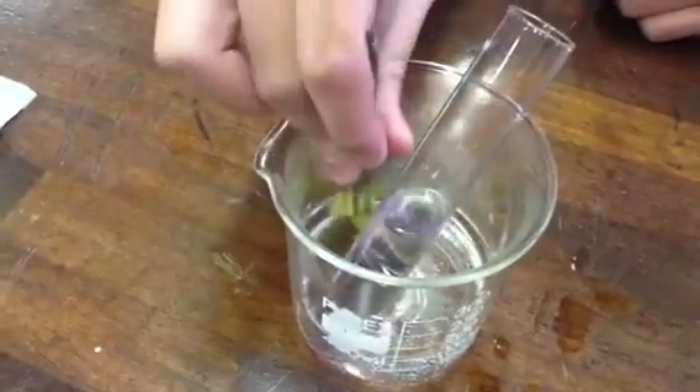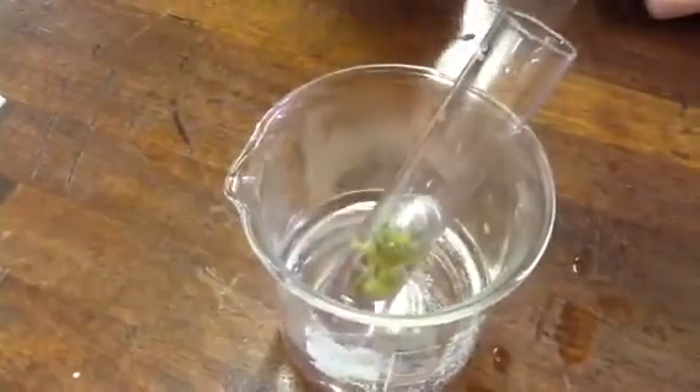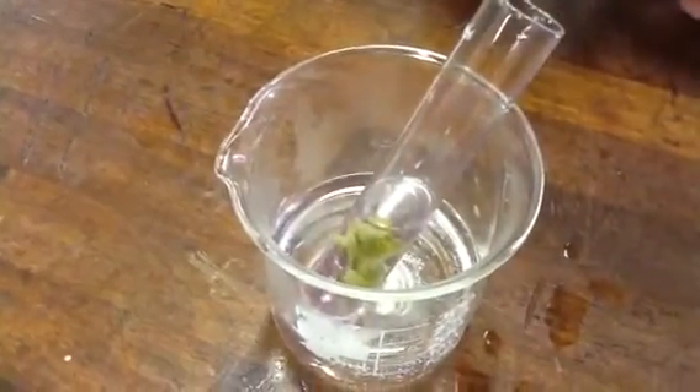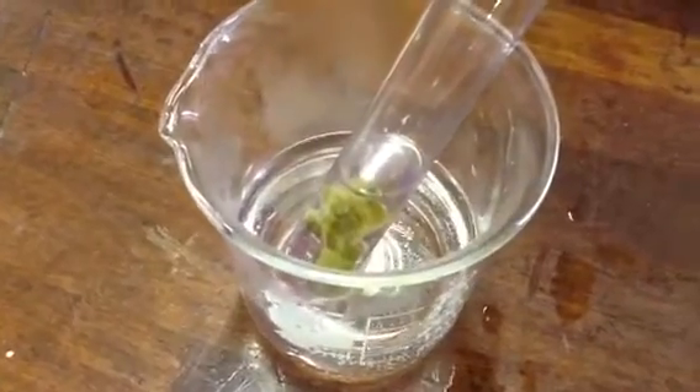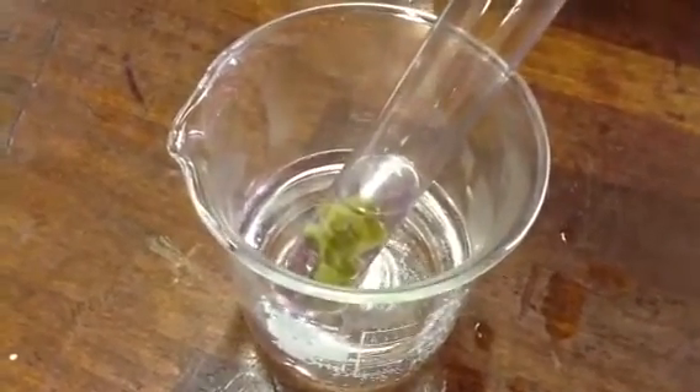Now Richard, would you, using your tweezers, please transfer the leaf into our alcohol? We're going to leave it in the alcohol for 10 minutes in our hot water bath. Why are we placing the leaf into the alcohol for 10 minutes? To remove the chlorophyll. Excellent, to remove the chlorophyll.